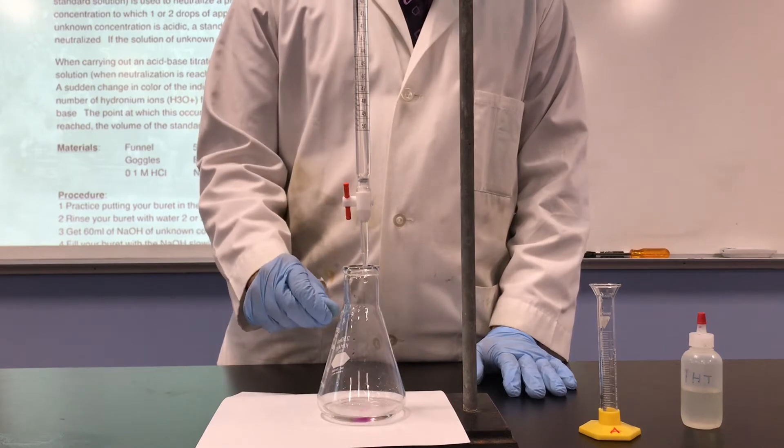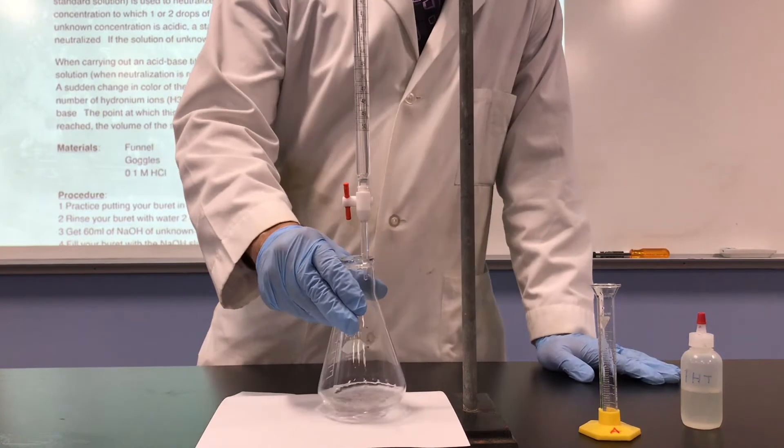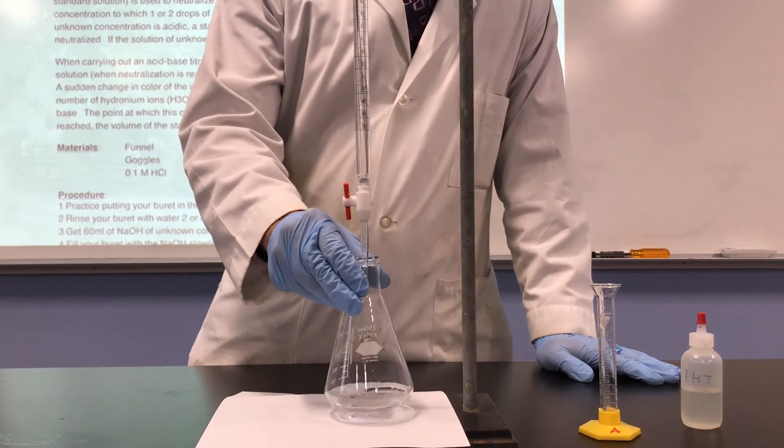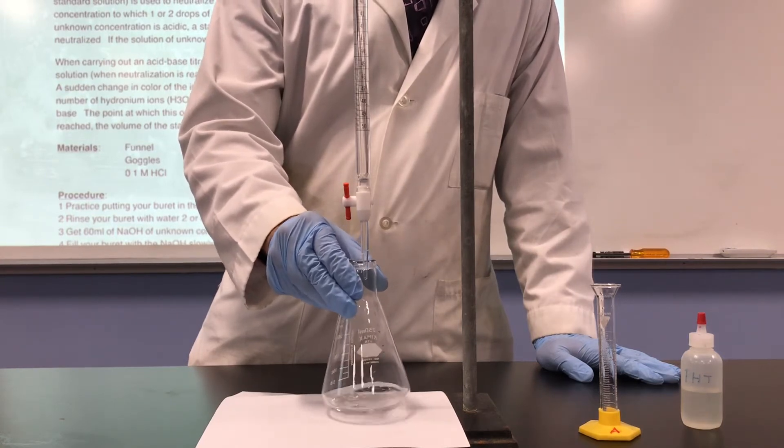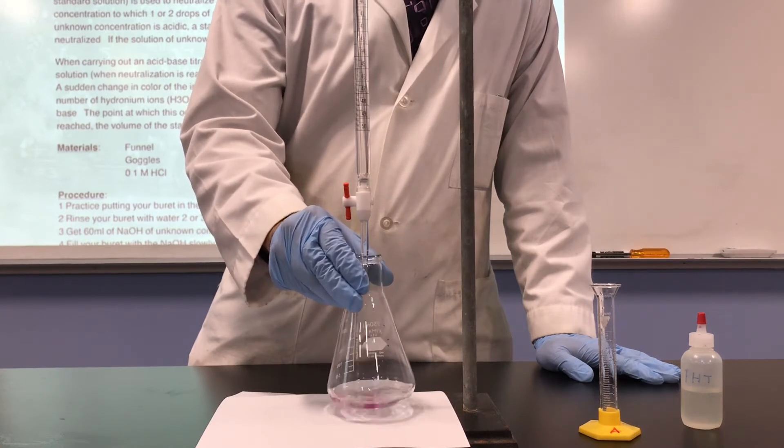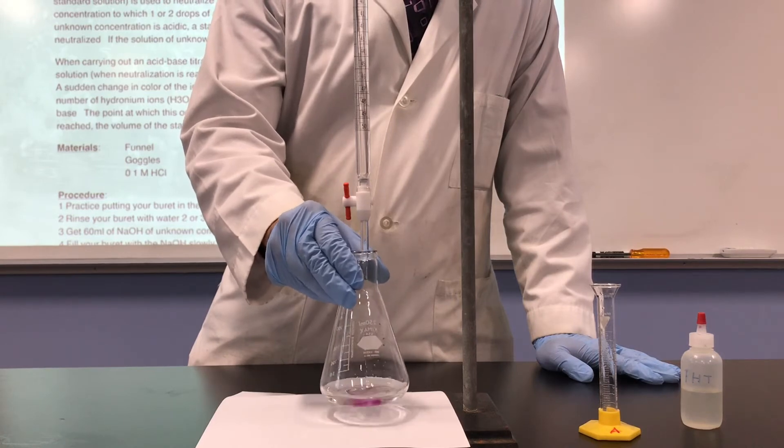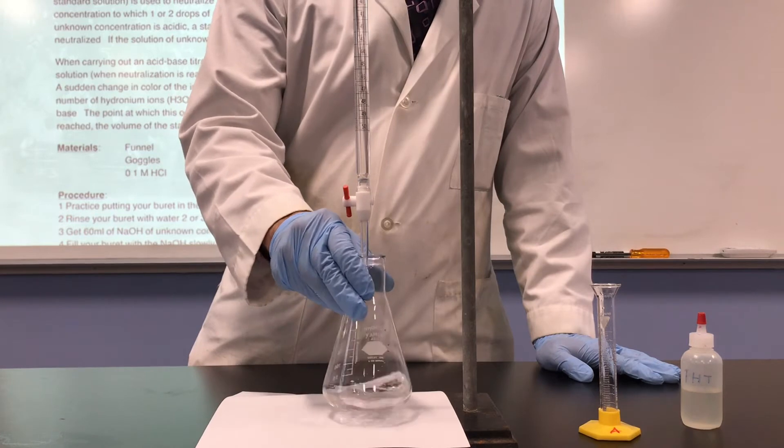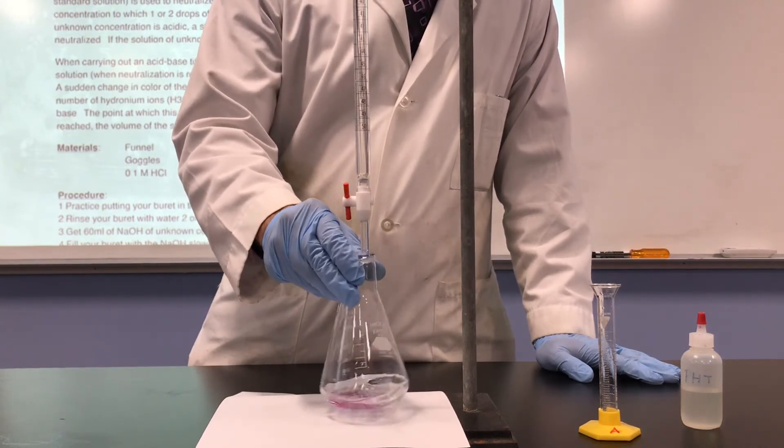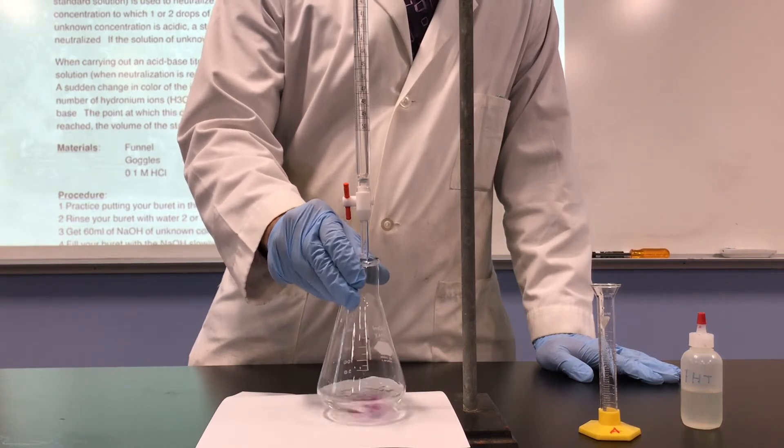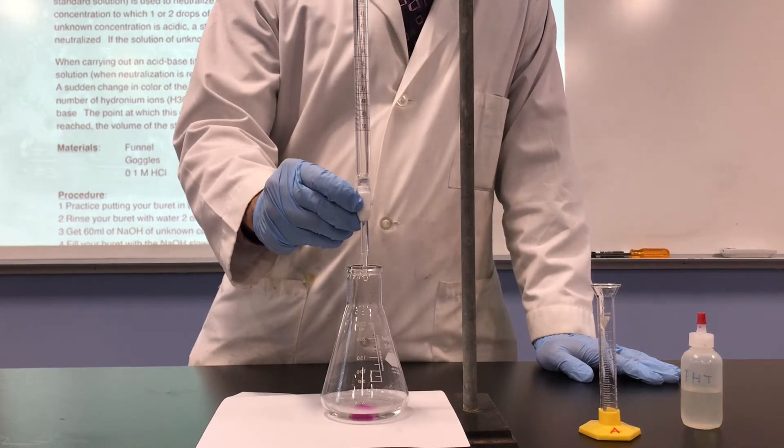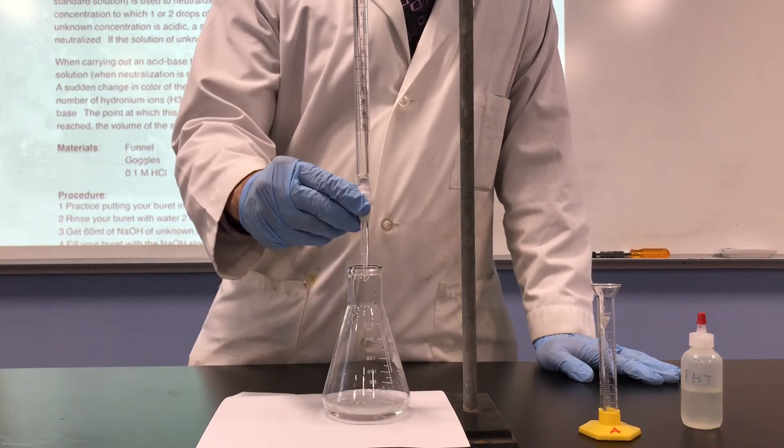Now you might be able to see that once the base goes into the acid and phenolphthalein, you get pink in the solution. But when you swirl, the pink goes away. We know we reach our end point when the pink stays for 30 seconds of swirling. As you can see, as we put more base in there, the pink stays a little bit longer each time. The pink is a good sign. That means we set up everything properly. Phenolphthalein is colorless in acidic conditions, and it turns pink under basic conditions.